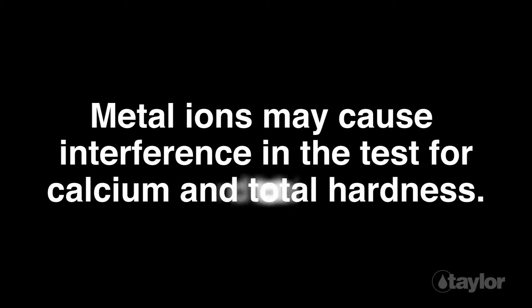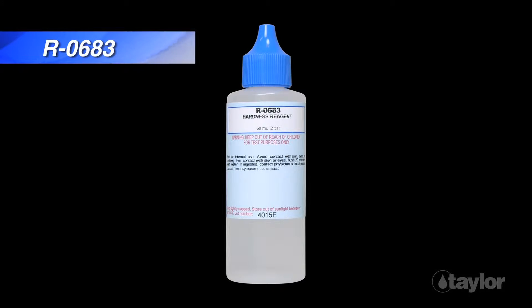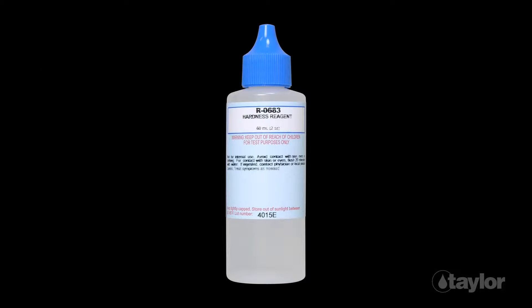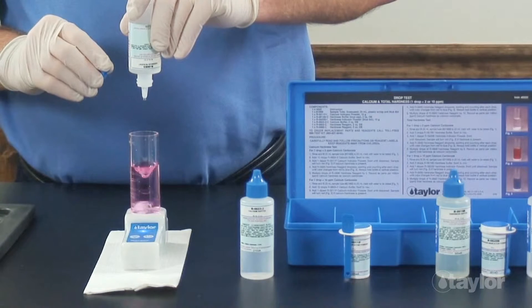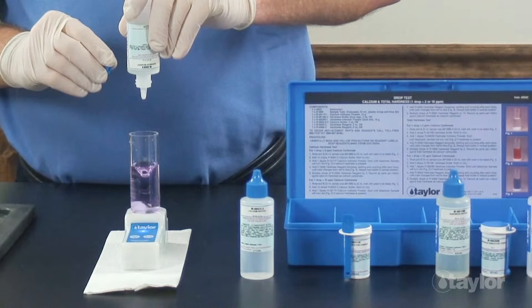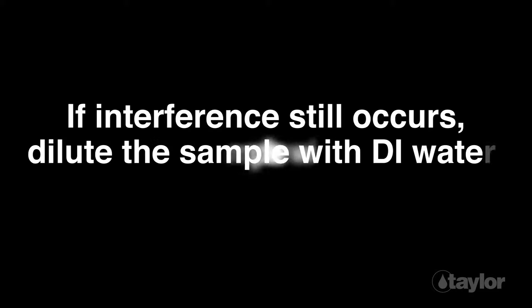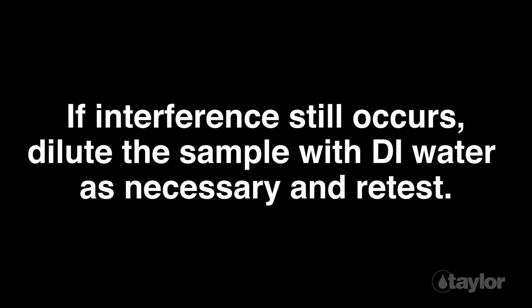Metal ions may cause interference in the test for calcium and total hardness. If your sample reaches a blue endpoint but then slowly reverts to red, this is an indication that metals are present. To prevent this interference, add two or three drops of hardness reagent, which contains EDTA, to your sample before adding the buffer and indicator, then test as normal, making sure to count those initial drops in the total required to reach the endpoint. If interference still occurs, dilute the sample with DI water as necessary and retest.